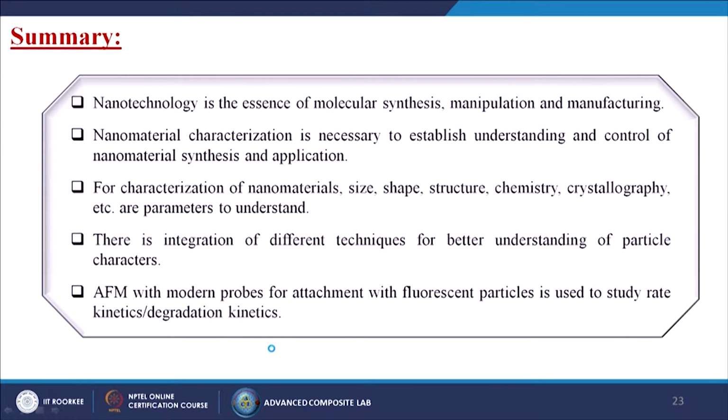There is integration of different techniques for better understanding of the particle characteristics. AFM with modern probes for attachment with fluorescent particles is used to study rate kinetics and degradation kinetics.